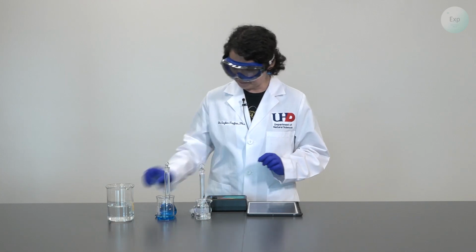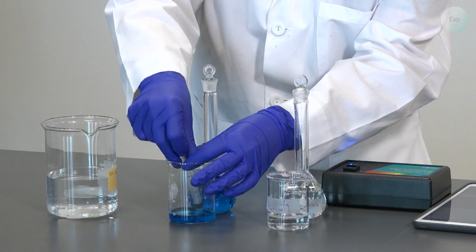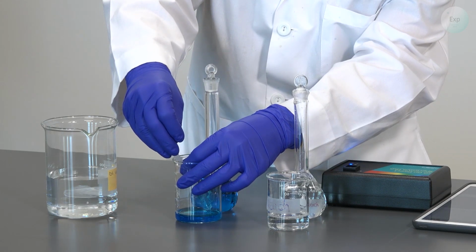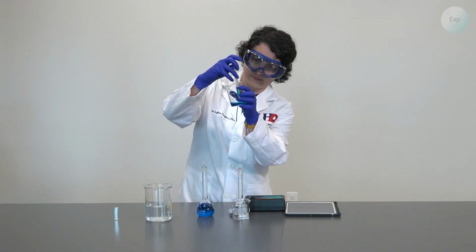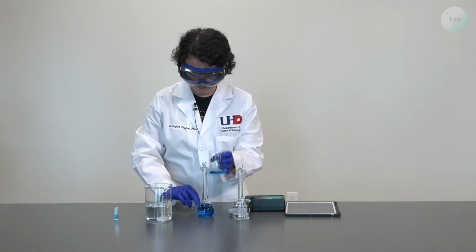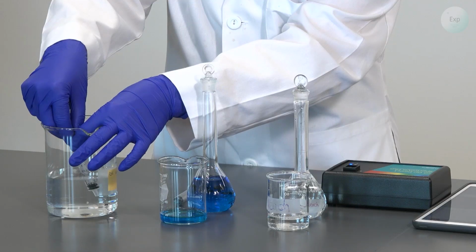We take our cuvette. We add to this 1.5 milliliters of our blue food dye. 0.75 milliliters of our deionized water.